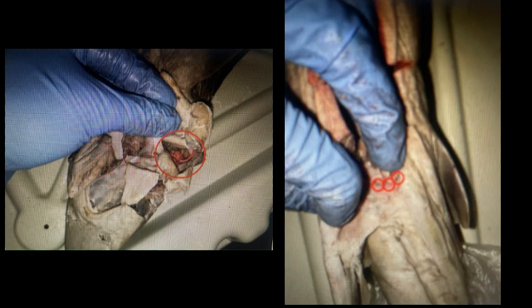In the case of the gills, we can compare this with gas exchange, similar to the oxygen and carbon dioxide exchange in the gills. The extra urea might diffuse out of blood into the water and then be excreted in the sea. On the other hand, the kidney will form urine, and the urine is drained from the caudal end of the kidney through an accessory urinary duct into the cloaca through the urogenital papilla.